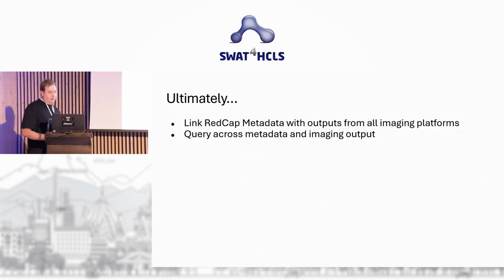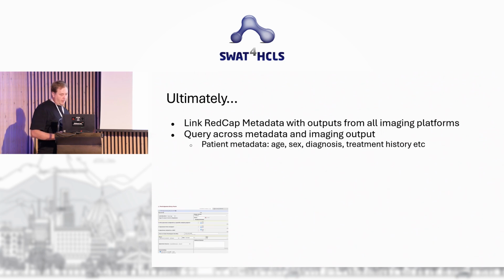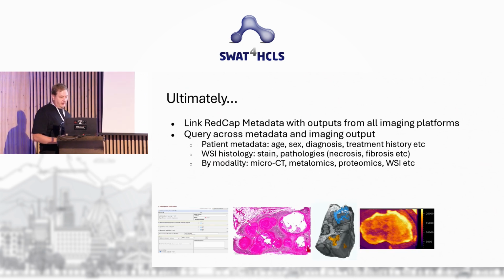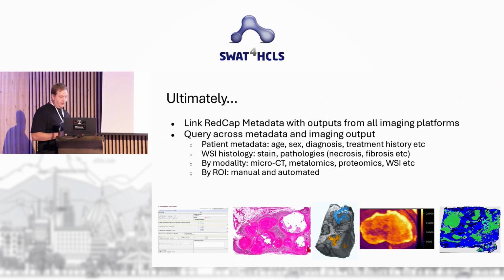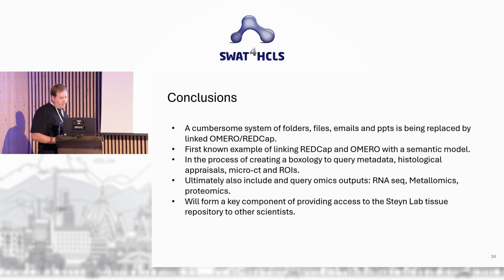So ultimately we want to link REDCap metadata with outputs from all the imaging platforms so we can query across them, including all the patient metadata, things like the histology, what stain was used, what pathologies are present in the images by the various modalities with the ROIs. And we want to reach a point where we can use this to feed queries into machine learning tools for automated segmentation and so on.